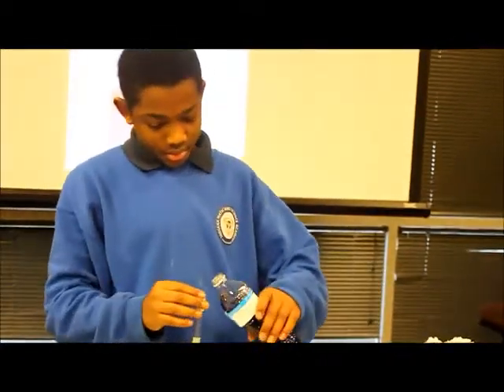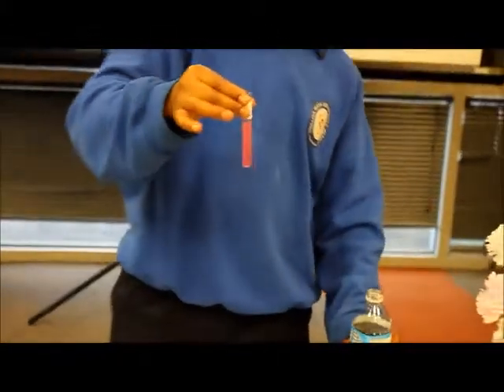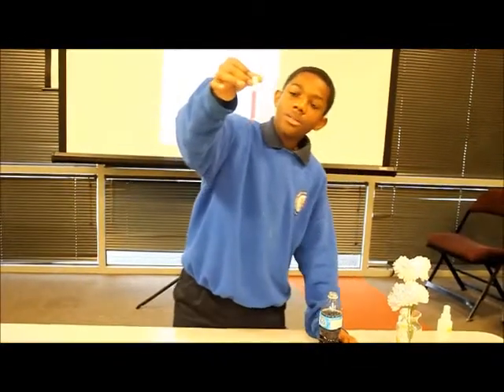Up next, lemon juice. As you can see, the lemon juice is yellow, and now it's pink.